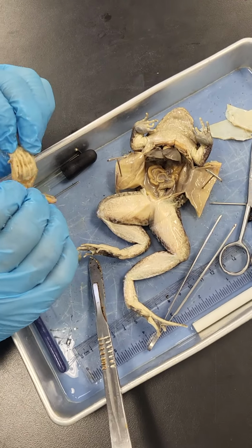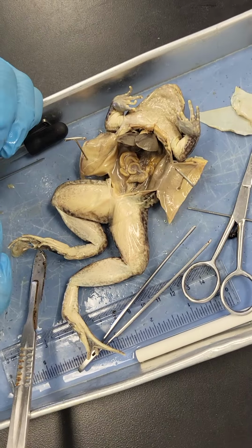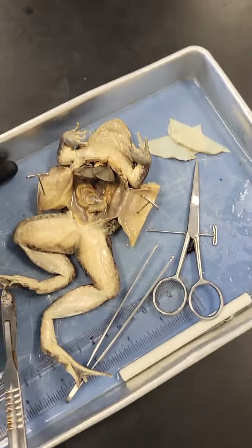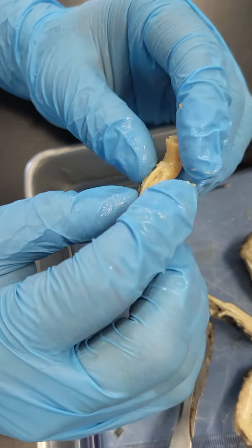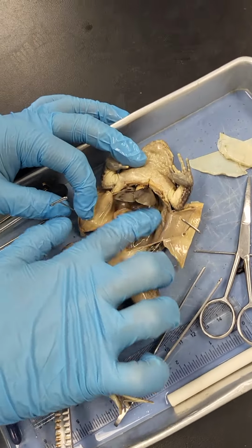They got the molten kill out. Over there. Stomach's inside out. They get the extra points. What did you find in the stomach? Nothing. There's nothing in the stomach? He was starving. Now we know how he died. Yeah. Starving frog. Oh my god.